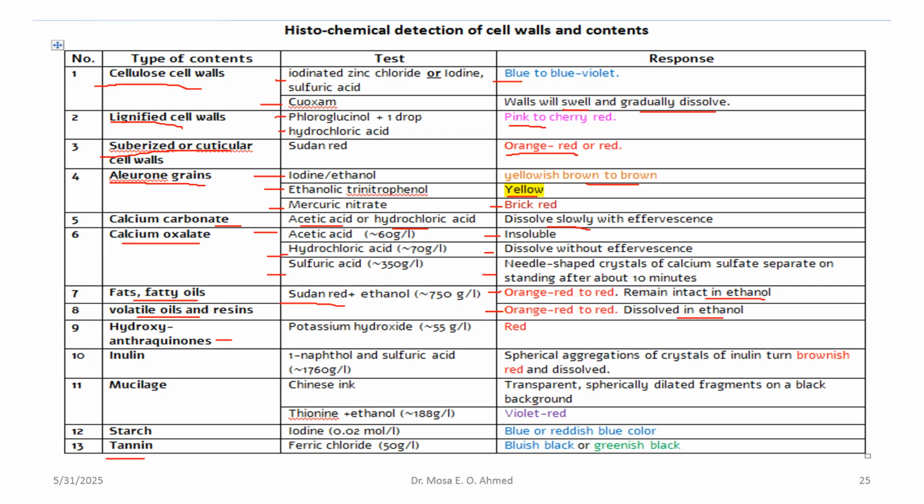Hydroxyanthraquinones are natural dyes, and some of them have pharmacological activities, such as senosides, emodin and chrysophanol. All these are anthraquinone compounds having pharmacological activities, most of them used as laxatives. Hydroxyanthraquinones can be detected by addition of potassium hydroxide. They give a red color with potassium hydroxide.